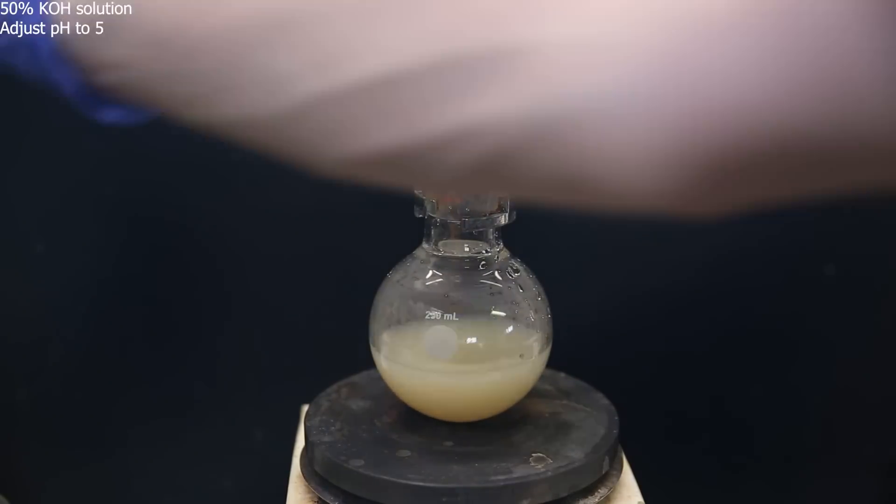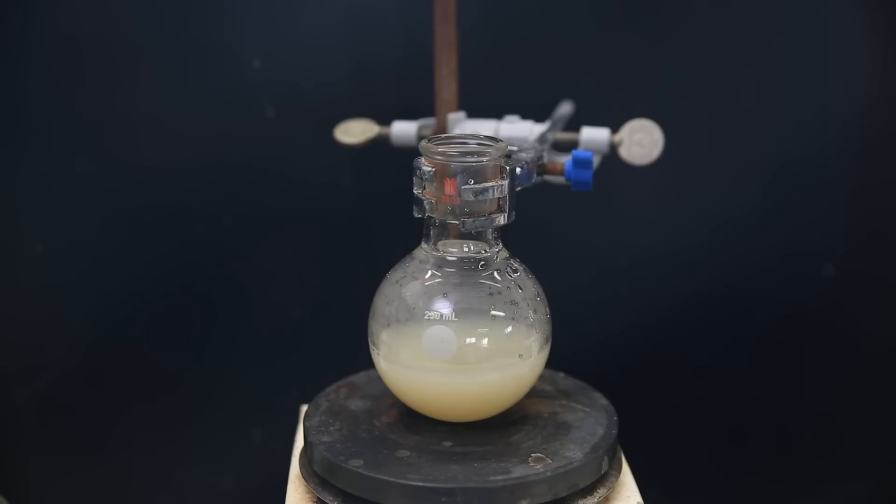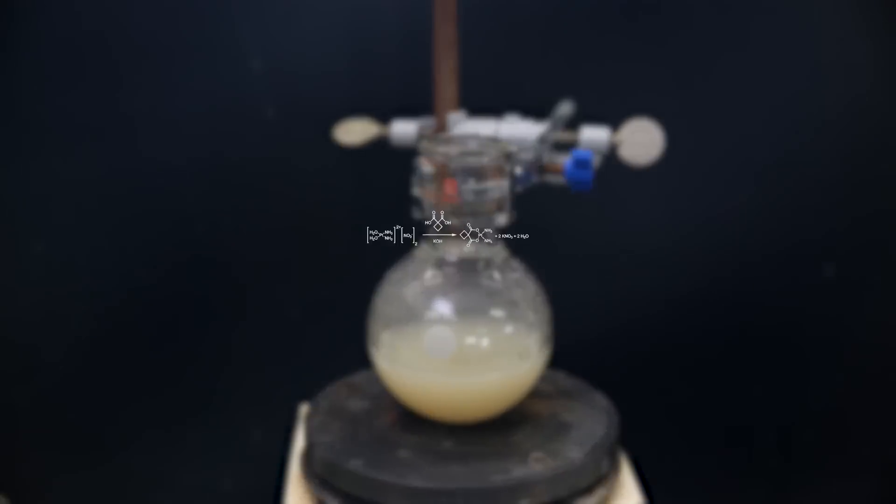Each time I add the potassium hydroxide, a dark precipitate forms that redissolves immediately afterward. After a while, the pH is correct, and it has become a bit milky, and I leave it to stir for 3 hours.